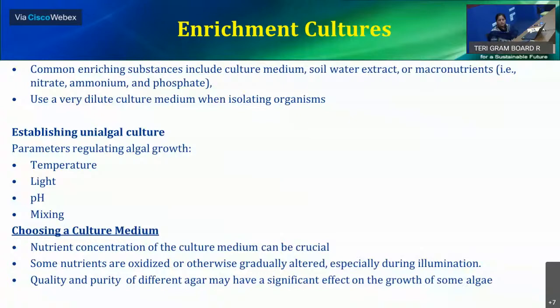And the most important thing is the mixing, like whether the culture should be grown under static or under shaking conditions. So if you have collected from a pond, then that algae may not need shaking. But if you have collected from the streams or the tides, then yes, that strain might need to be put under the shaking condition.